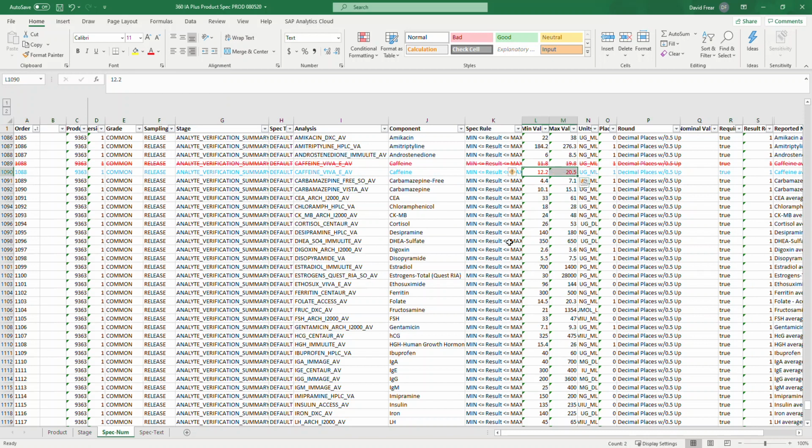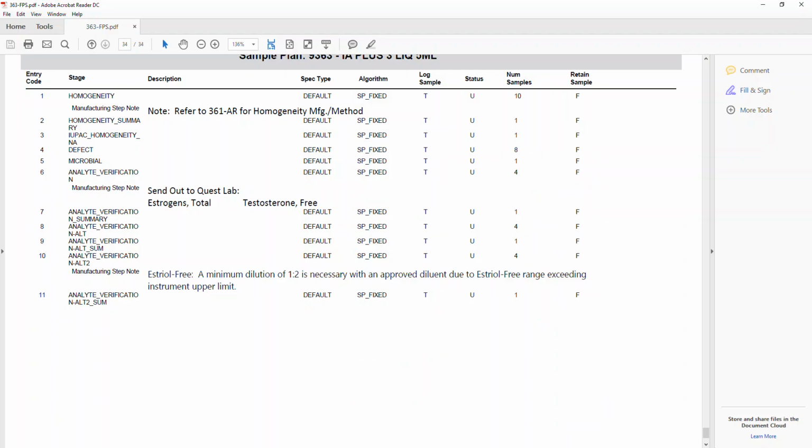So like I said, you can ask one of the people from the LabWare group, or ask someone from QA to export this. So handle it the same way you would handle doing recipes in SAP. And then this can be passed over to the folks that make the changes, and we can update the changes. So that's kind of the full product report.